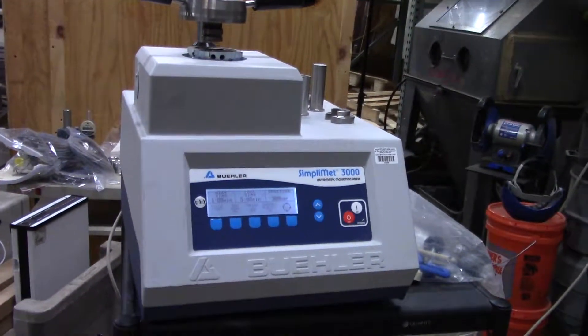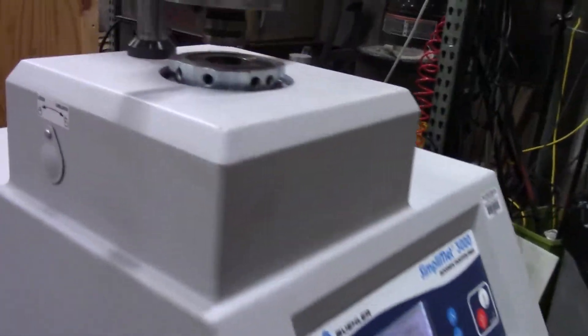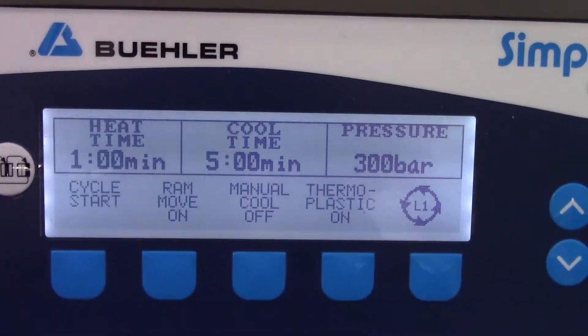Hi, this is Jim from HitechTrader. We have the Buehler SimpleMet 3000 Mounting Press. I don't know a lot about how it works, but I'll show you what we have.